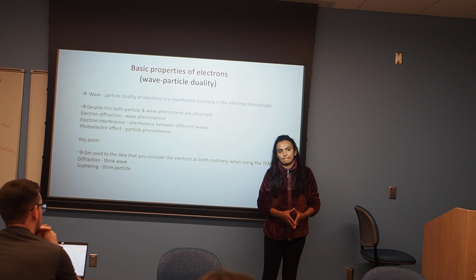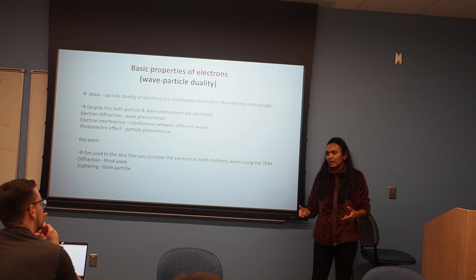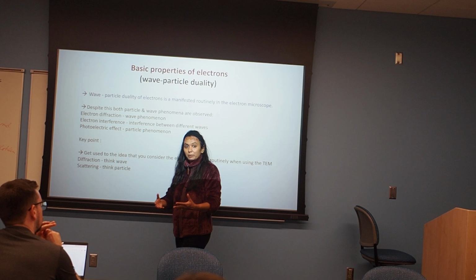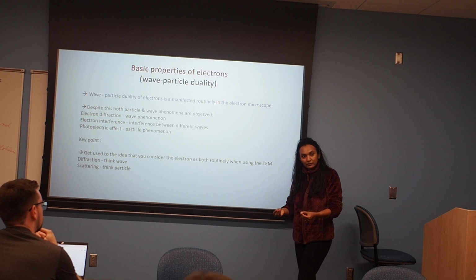So versus neutron, electron, or light, what do I use in which case? Whenever we need a low magnification, I can do light, because there is a certain energy that light can have. For higher energy, or for a place where I need a resolution in nanometers or picometers, I will go and use electrons. Now, what is the general electron energy that we use? 200 kV. 200 or so.